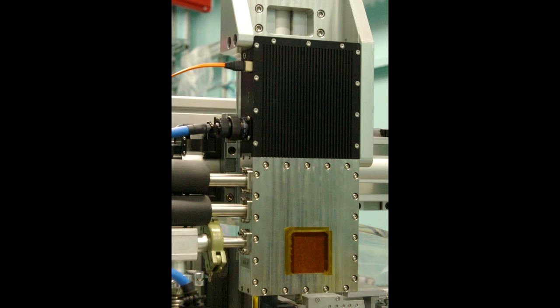We imaged some pictures from the San Francisco Fine Arts Museum, where we were interested in what was underneath the paint. It turned out those paintings were painted over a photograph, and we were able to image the photograph without removing the paint, just by using the X-ray fluorescence signature of the silver in the photographic print. And we did that for 2 pictures. And so that made us known to the world in this art history kind of context.